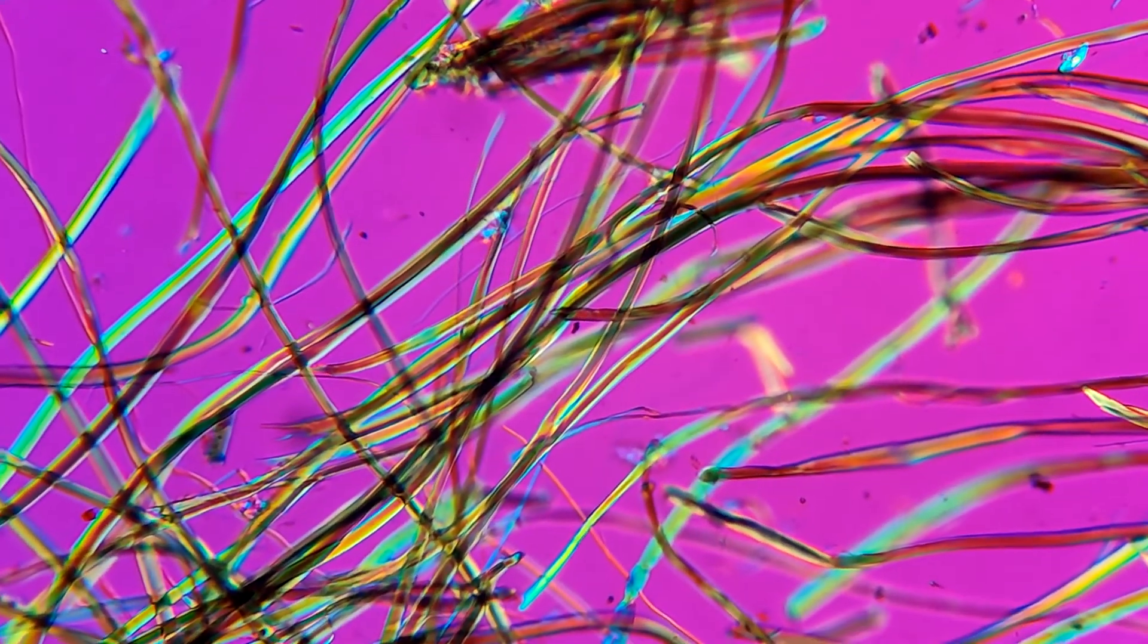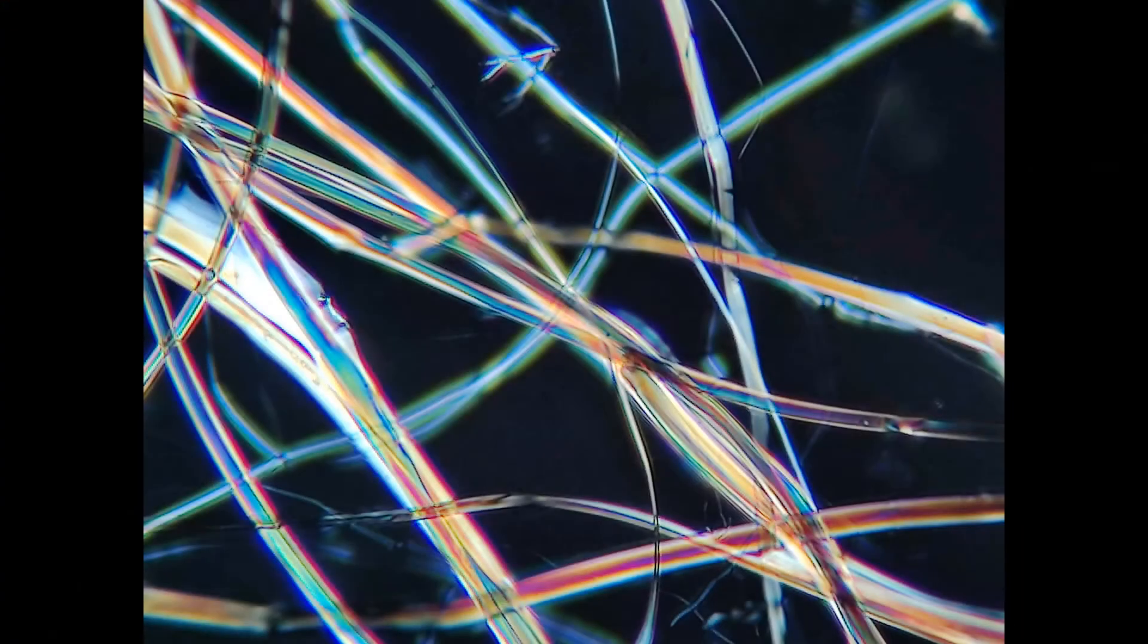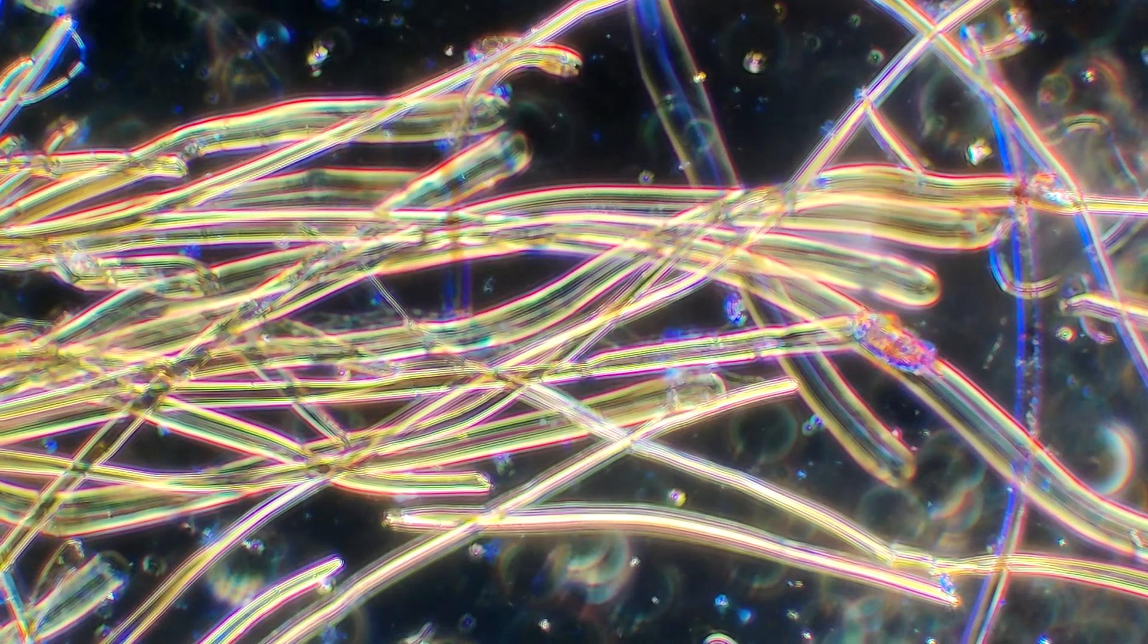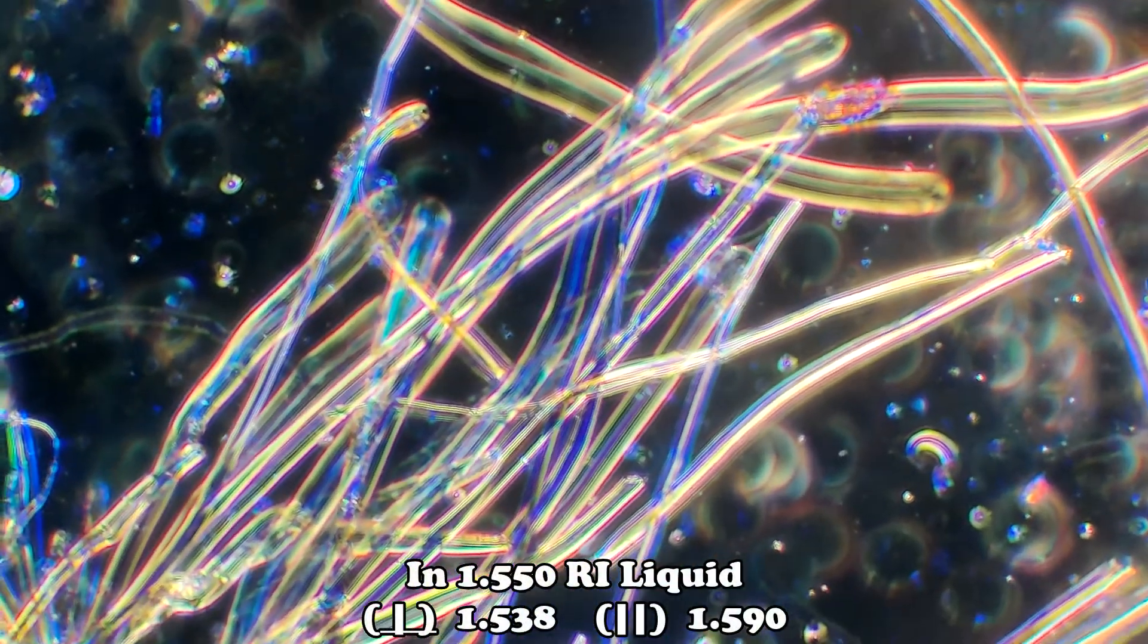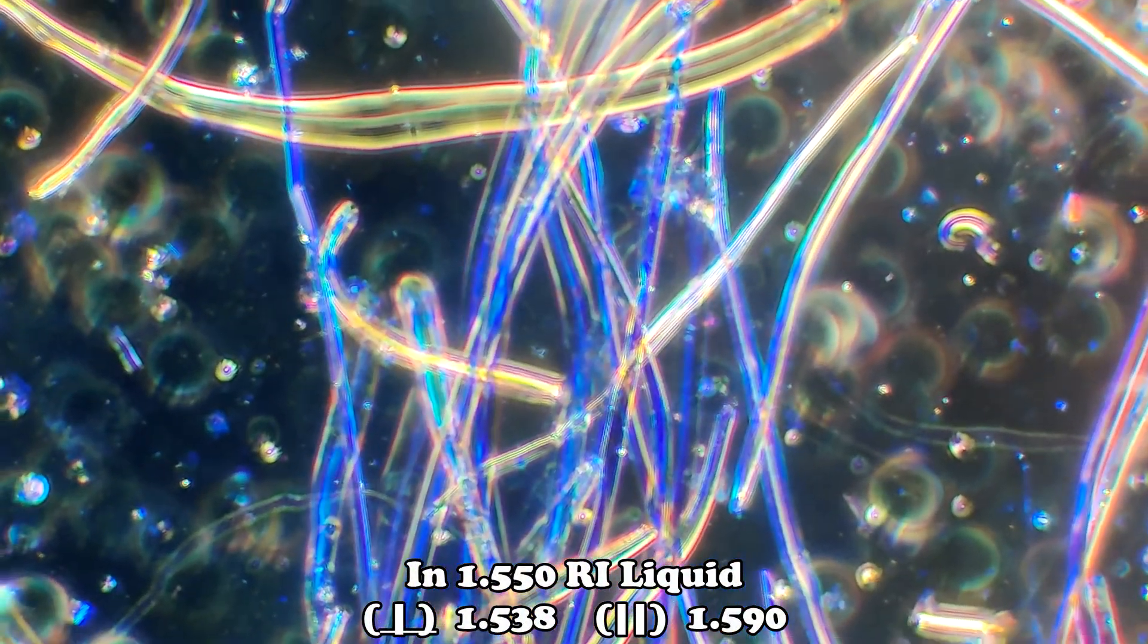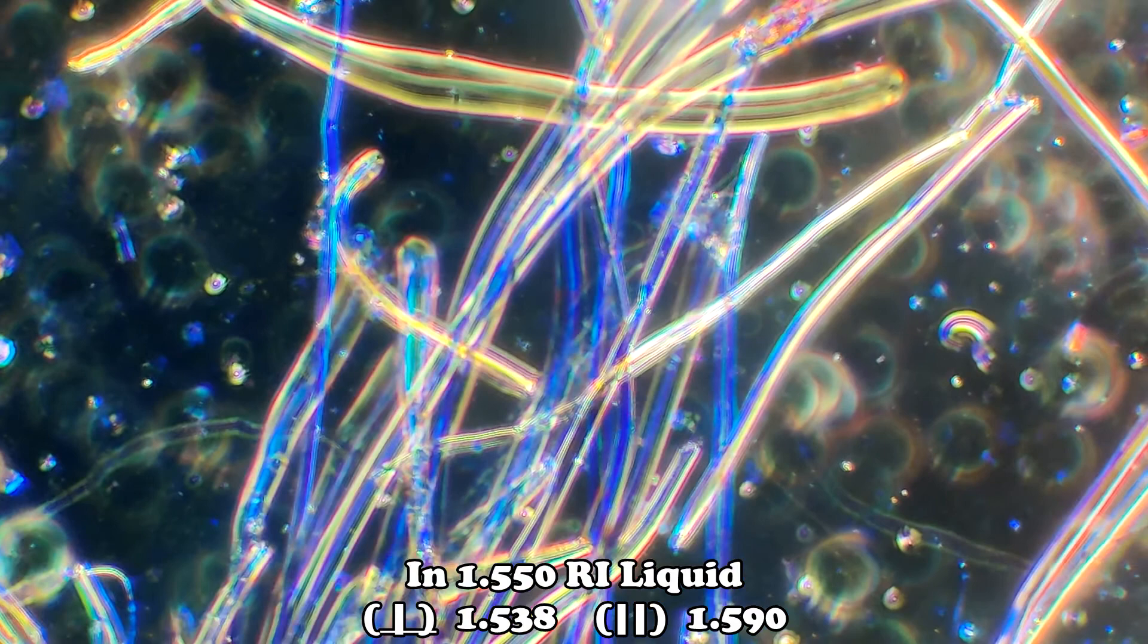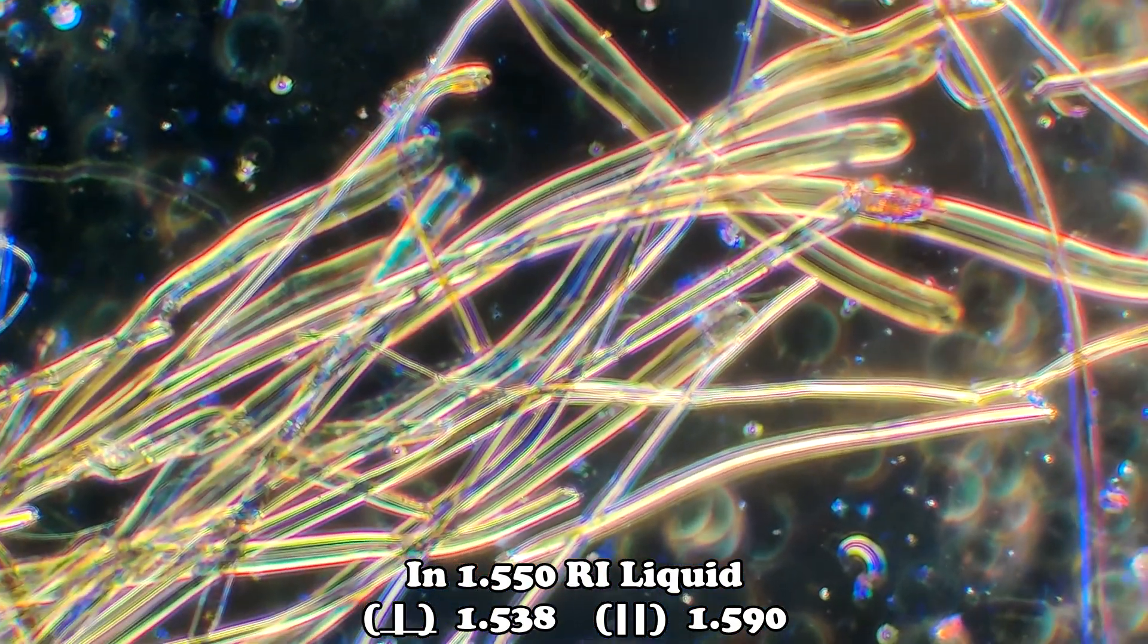Silk also exhibits a positive sign of elongation and a birefringence around 0.05 to 0.054. When it comes to identifying silk, you have to be careful when it comes to the refractive indices. Under dispersion staining, the colors mimic that of cellulose.